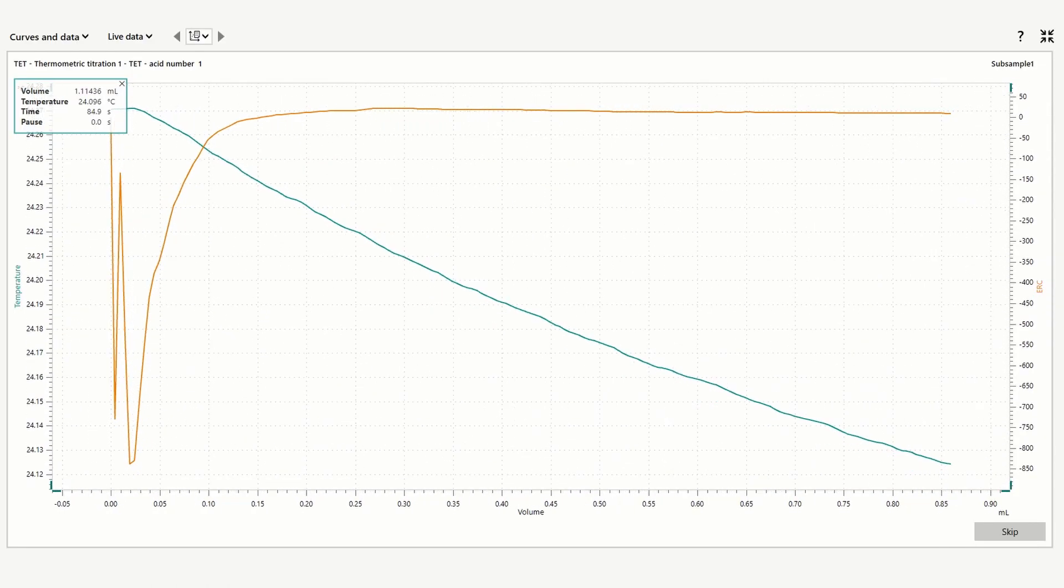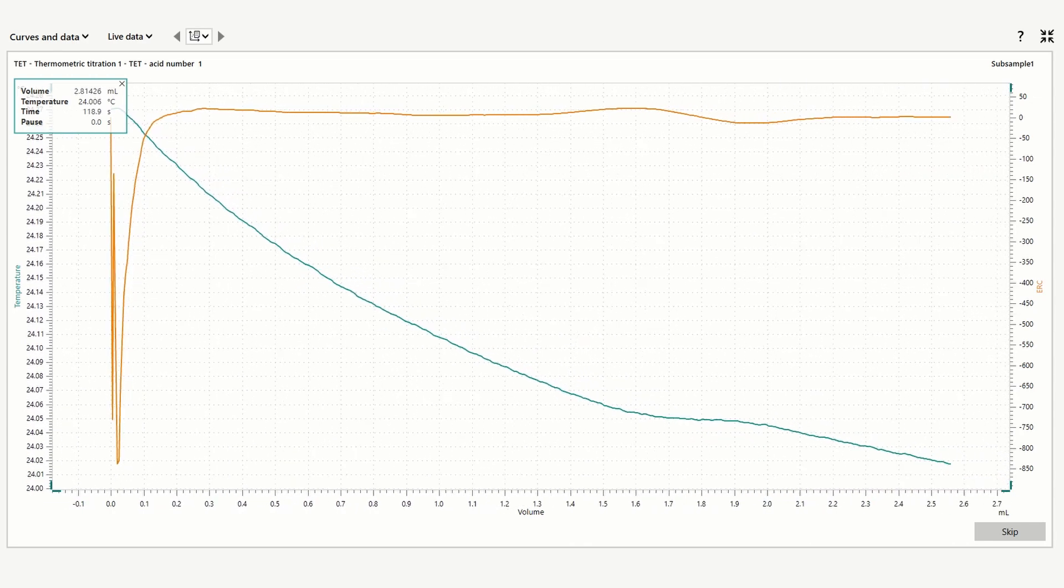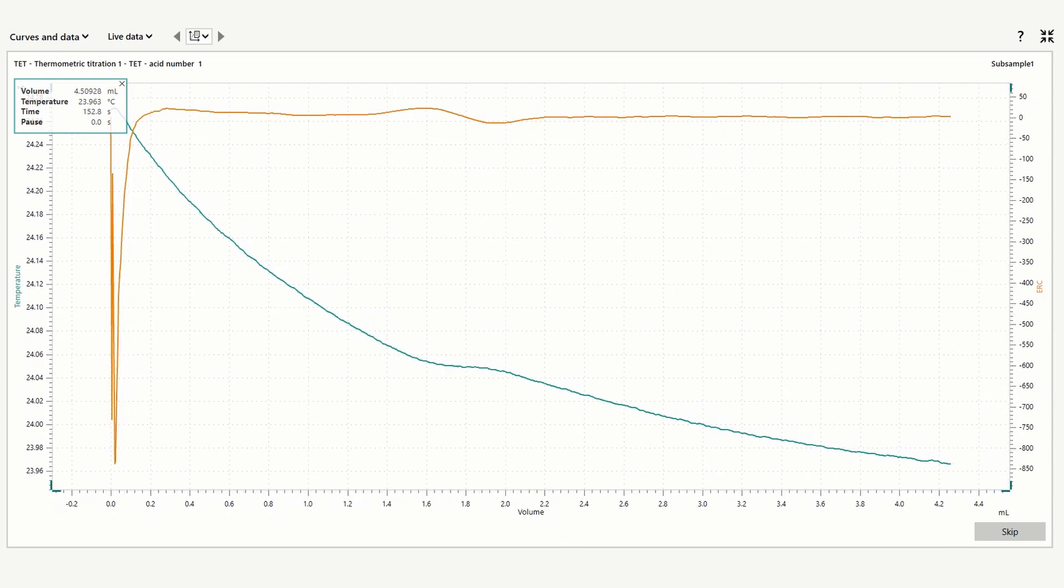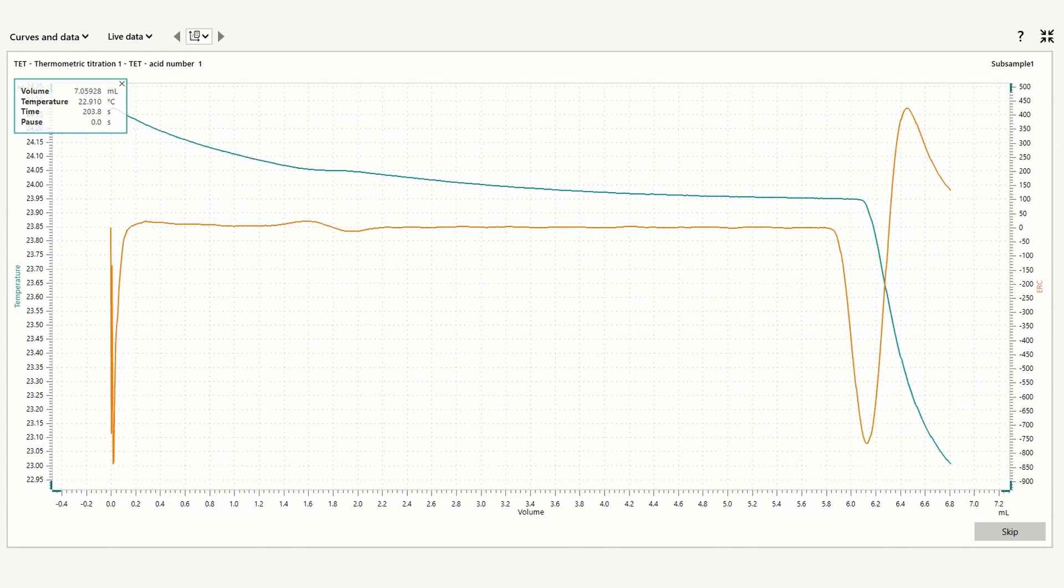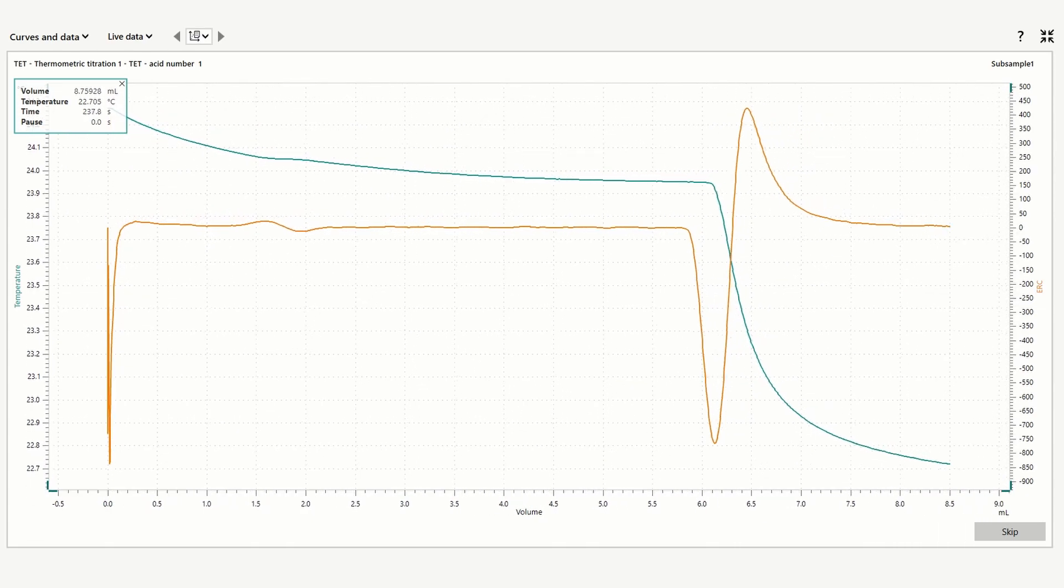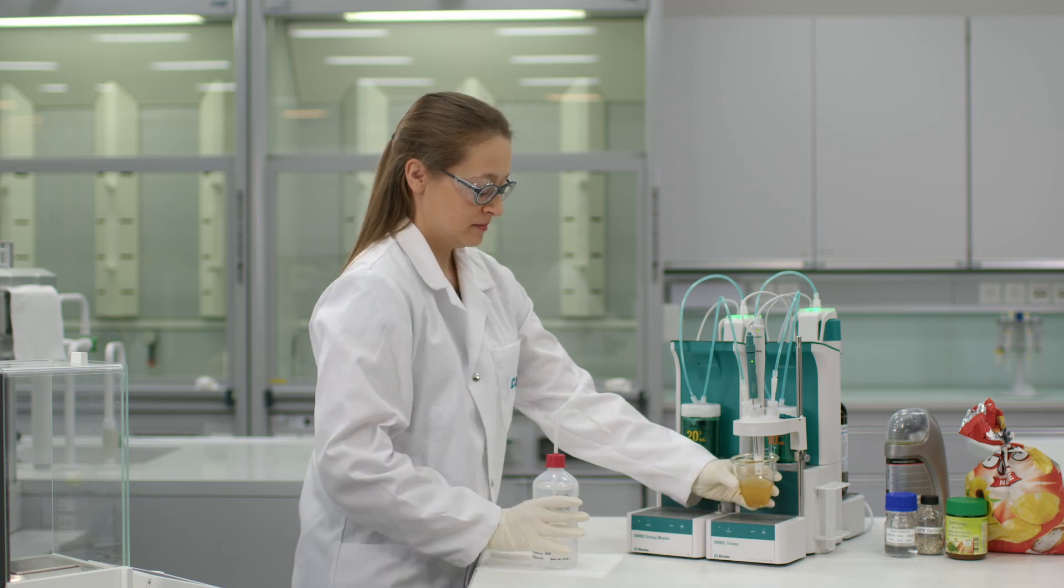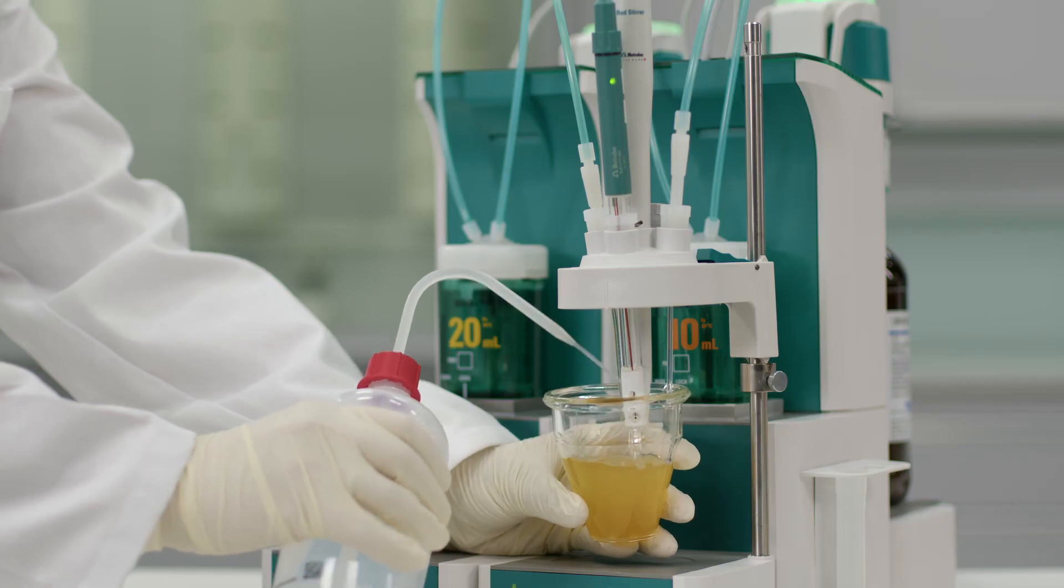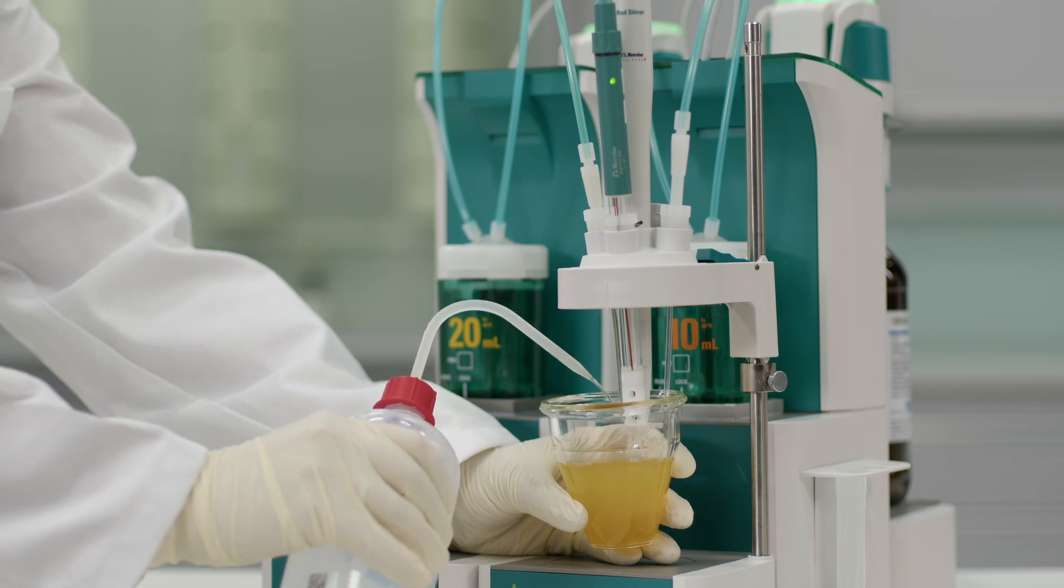One advantage of thermometric titration is the speed. Results are typically given much faster compared to potentiometric titration. It is not necessary to recondition the sensor. Simply rinse the D-thermoprobe and it is ready for the next sample.